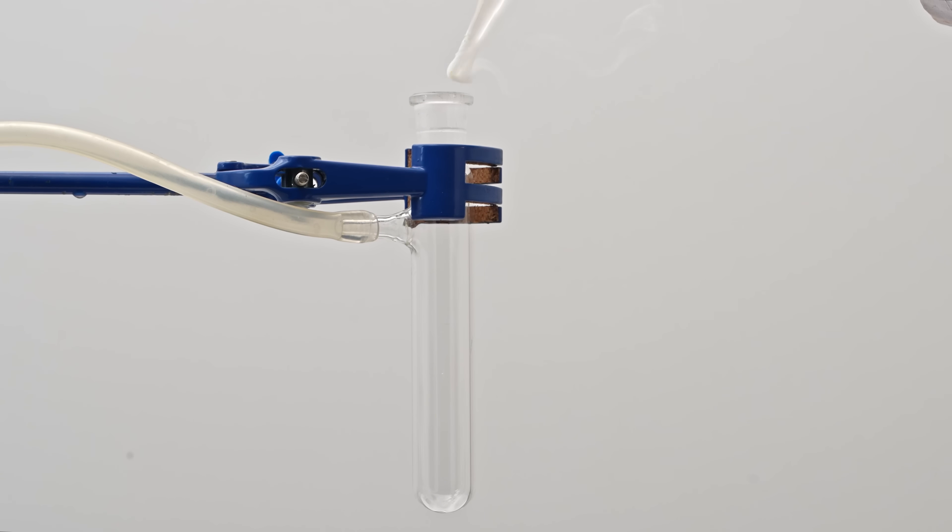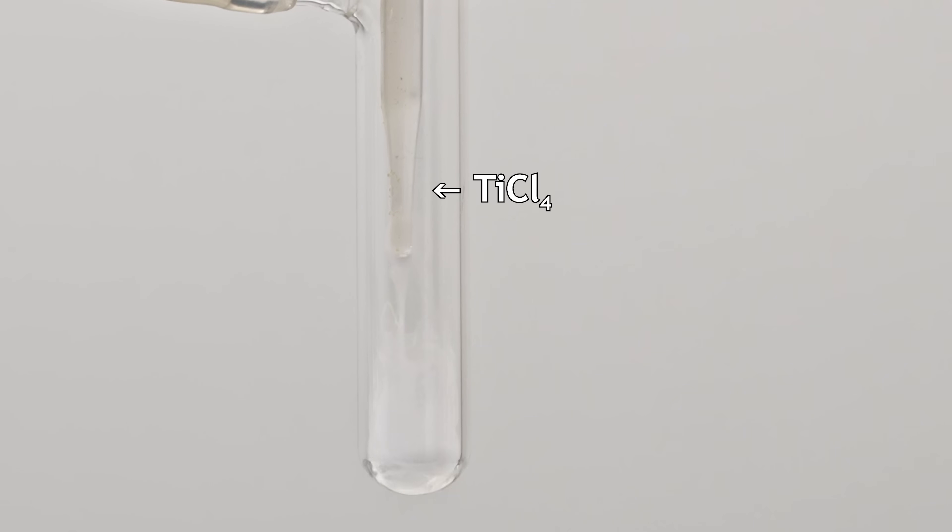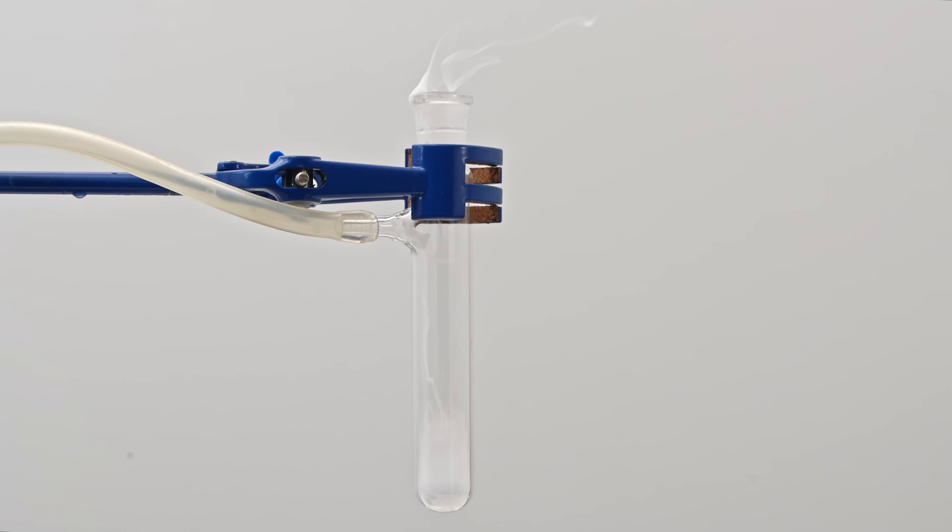Red dimers of nitric oxide can be formed easily by condensing it in the presence of a strong Lewis acid. For example, I used titanium tetrachloride. Just a few drops of this Lewis acid dimerized the nitrogen monoxide at its boiling point.